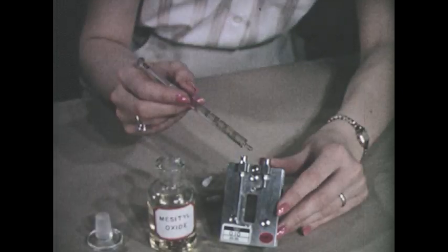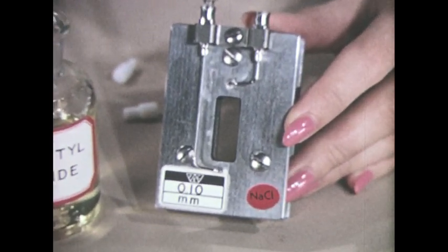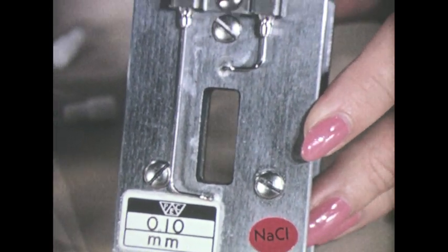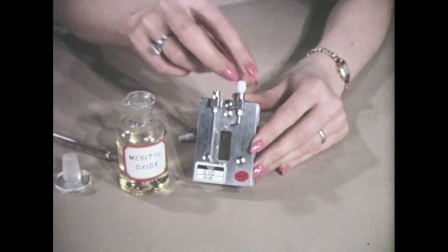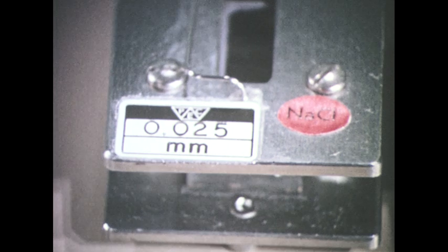This sealed cell is constructed in the same manner as the demountable cell, but has a fixed spacer of known thickness. It is filled with a hypodermic syringe. Only 0.2 of a milliliter, or about 5 drops of a liquid, are needed. The cell is sealed with inert plastic plugs. Sealed cells usually vary in thickness from 0.025 millimeters to 0.1 millimeters.